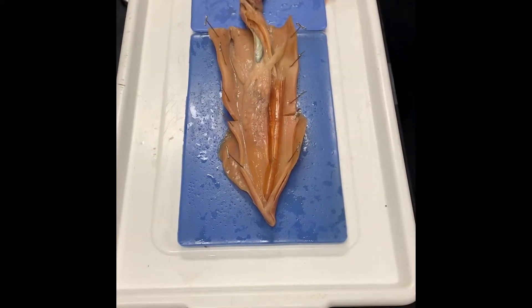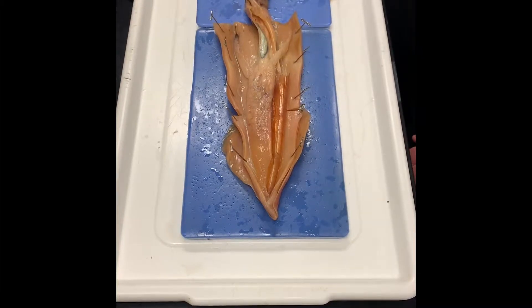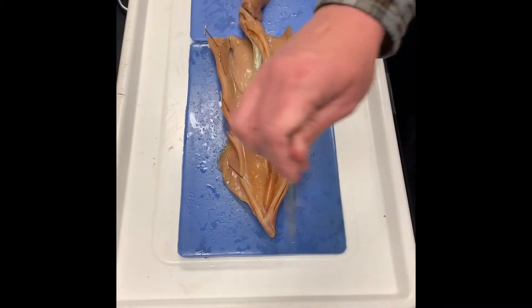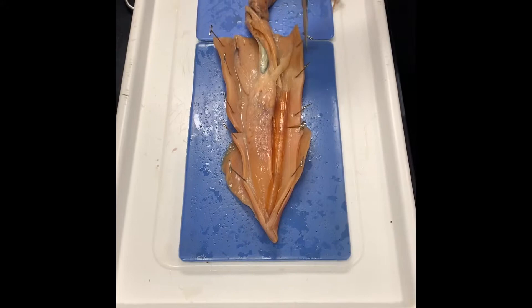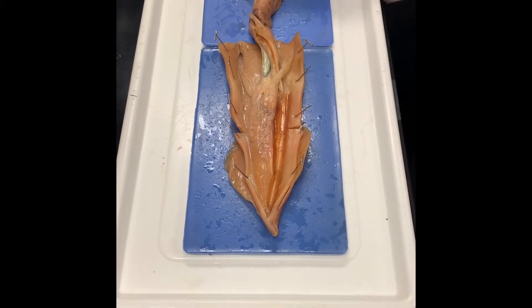There's external anatomy and then there's the internal stuff. We'll start with the external. Let's orient ourselves to what side is which. This is the top of the squid up here, so that's dorsal. That makes all of this the top half — the mantle. And so this down here is all ventral.